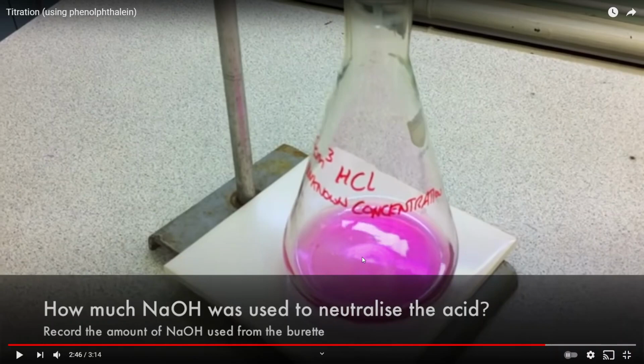Meaning, if you add more base to it, will you get pink back again? If you're below the line, then adding more means you still need to add more. Or did you add too much? If you added too much and you don't record your milliliters at that point, then you're going to continually drain it down and realize, oops, I don't know what my value was, I need to completely restart.